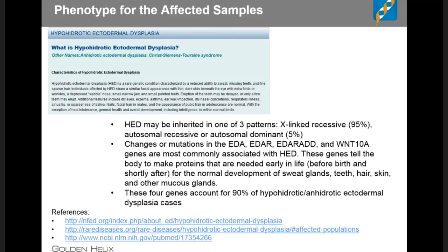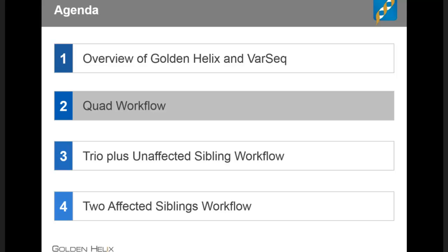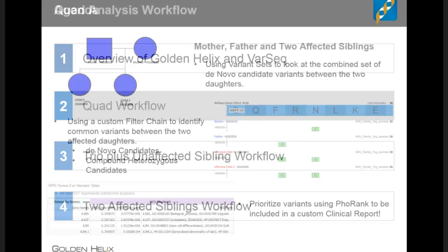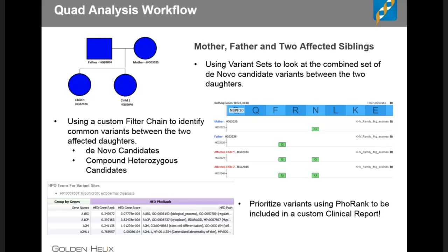Let's jump into VarSeq and begin looking at our quad workflow. For our quad workflow we have a mother, father, and two affected siblings. First I'll open the shipped trio template and determine the set of de novo candidates for each sibling combined. Then we'll jump to a project with a more customized template designed to find things in common between the two affected daughters — both de novo and compound heterozygous candidates — and then use full rank to prioritize variants before adding them to a clinical report.